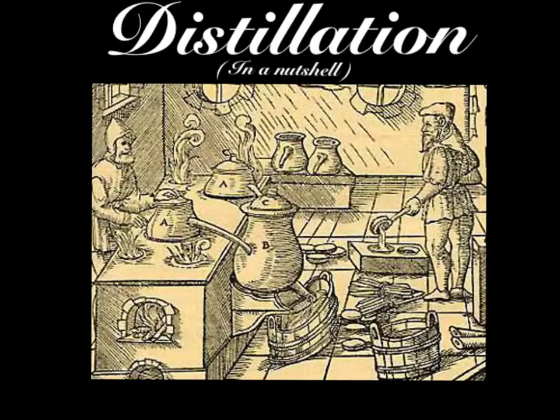The process of distillation has been around for thousands of years and can be traced back to the ancient Greeks. Since its discovery, the distillation process has been vital knowledge in shaping and changing human societies. But what is it? Simply put, distillation is a process used to separate mixtures. Separation is achieved because of differences in volatility.